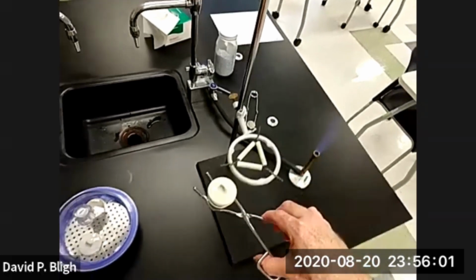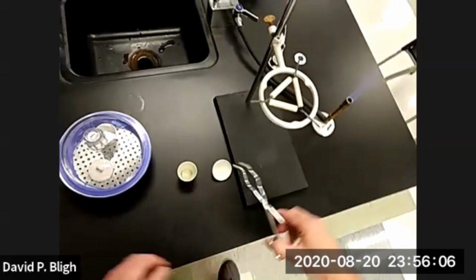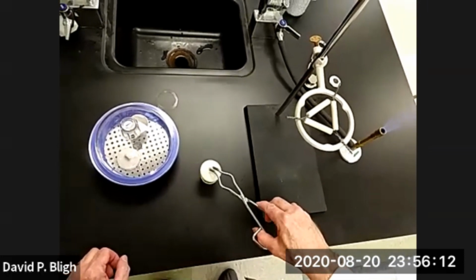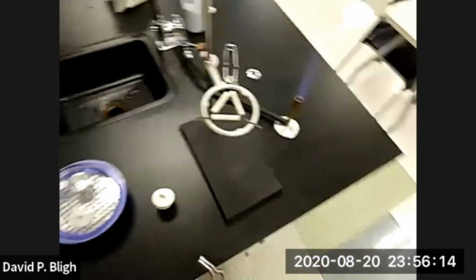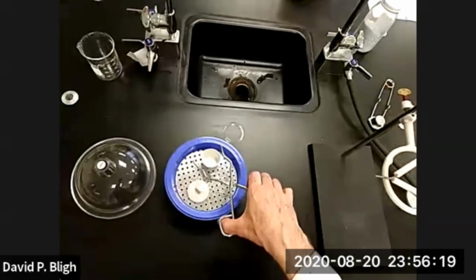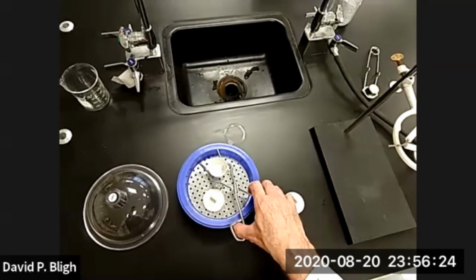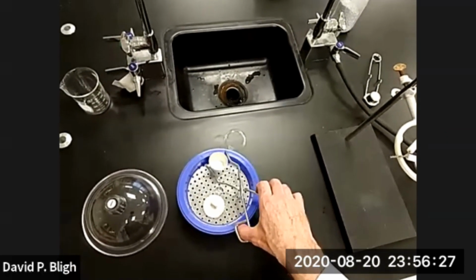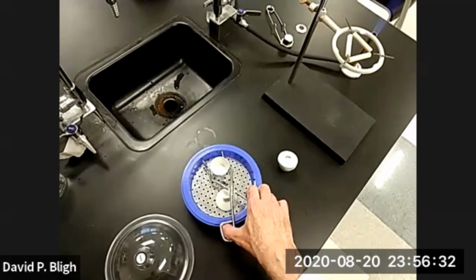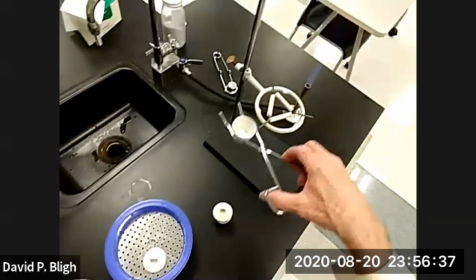So let's move it over here. Fortunately, I don't see any spattering. All right, there we go. Now let's move this one into the hot seat. Here we go. Don't spill it though. Don't be clumsy like your instructor. There we go. Now we can put it in the triangle.